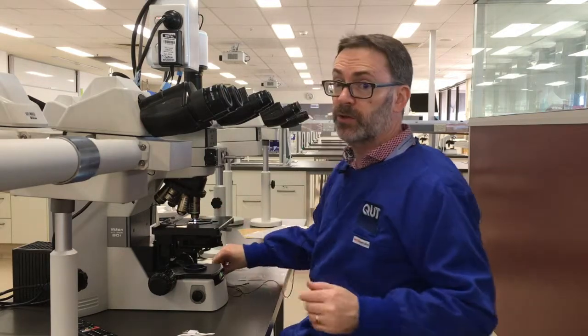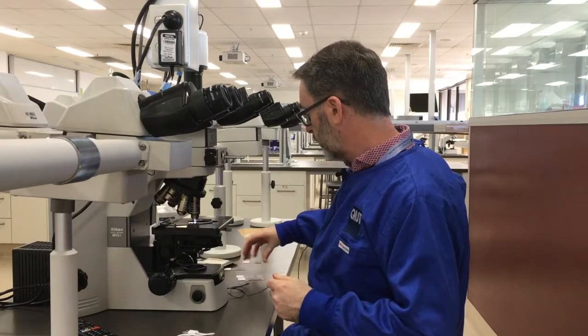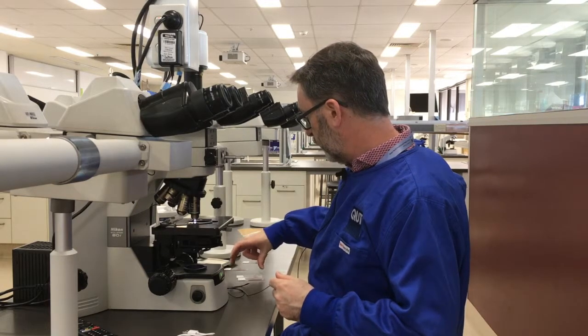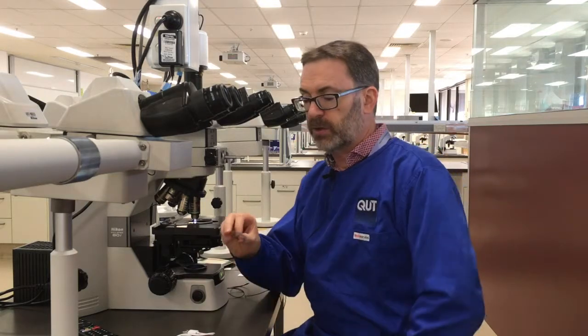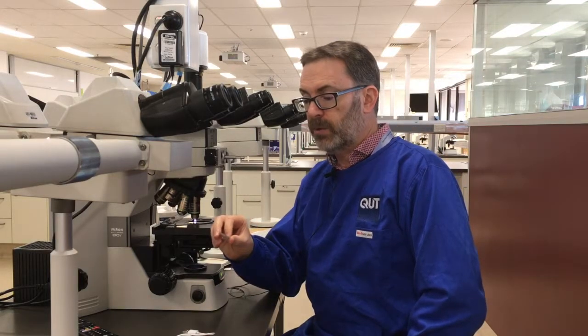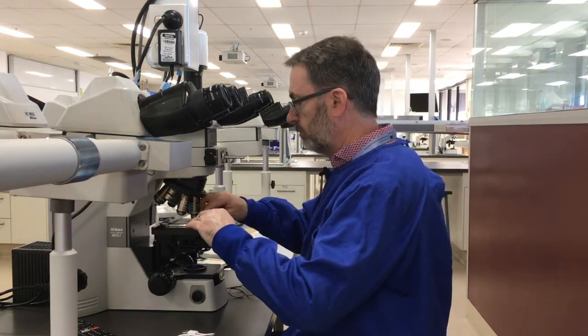So let's turn our attention now to a different tissue — let's look at some sections of skin and compare two slides. The first of these, we'll go with just the Mayer's hematoxylin again, so we should be seeing similar results to what we've just seen on the last slide.